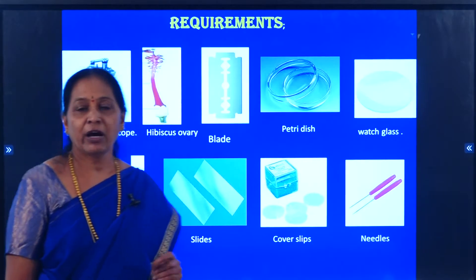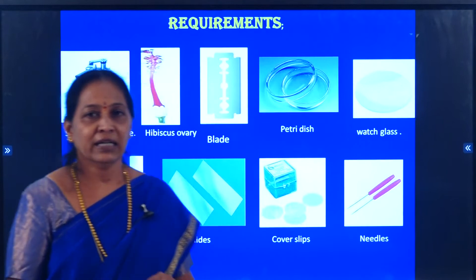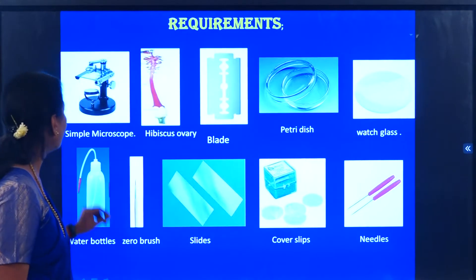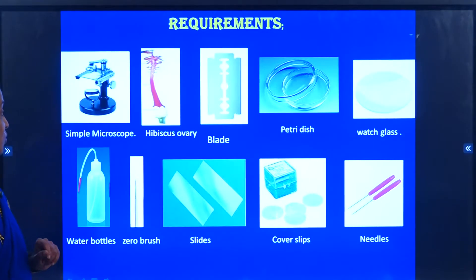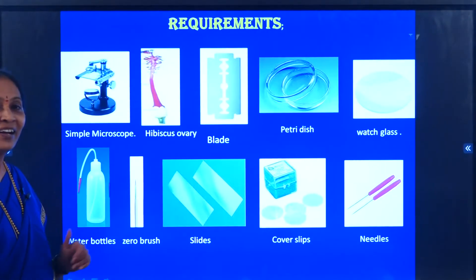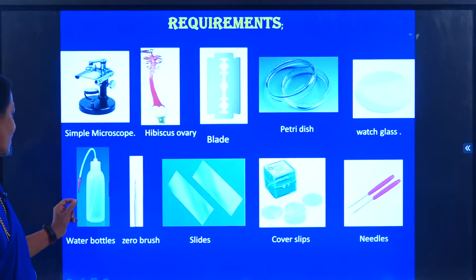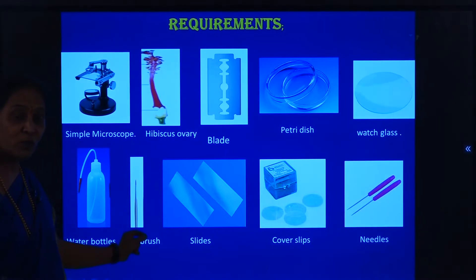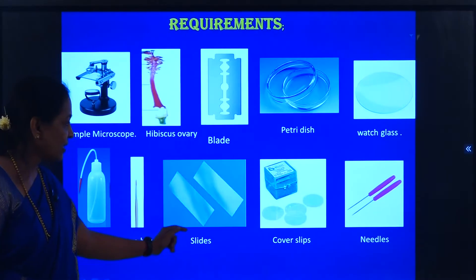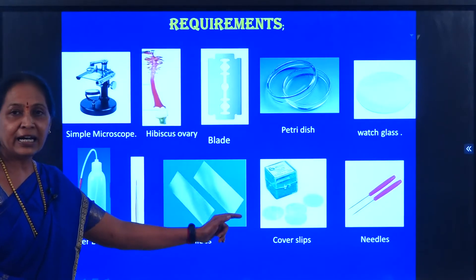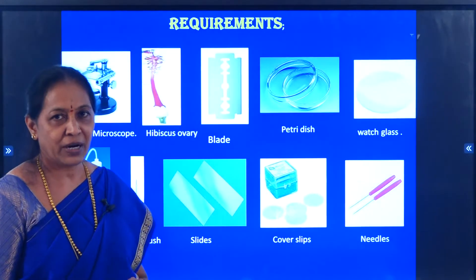We are going to learn the TS of ovary of the hibiscus plant. The requirements are: simple microscope, hibiscus ovary, blade, petri dish, watch glass, water bottle, brush (zero brush), slides, cover slips, and needles. These are the requirements for the practical class.